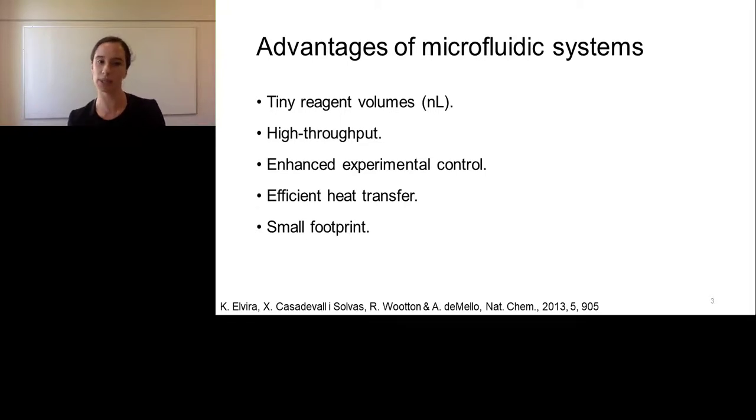And this is a bit tongue-in-cheek, because if you read the literature, you'll see lots of beautiful images of a chip and how we can use them. In fact, I presented one in my previous slide. But actually there is a lab around the chip. We are mounting our chips on a microscope, and we have pumping systems over to the side. So even though microfluidics definitely can be used outside of a laboratory setting, this is not something I will be talking about in too much detail in this presentation.